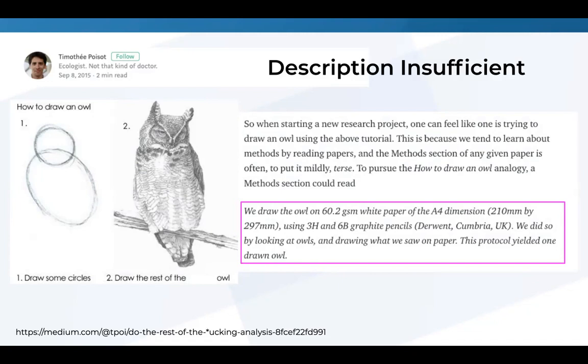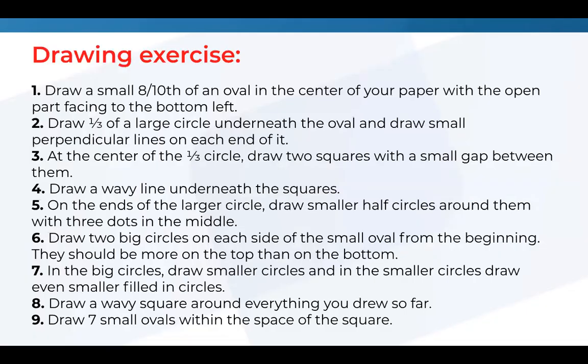So our goal with Protocols.io is to enable people to share the method details that are important. And we encourage people to share protocols in a step-by-step description. So this is what a step-by-step description could look like. This is not a scientific protocol, but a protocol for drawing an image. We won't draw this image now, but this is an exercise that I did with workshop participants a couple weeks ago. Everybody received this protocol for drawing a picture, and they had a couple minutes to follow this procedure.